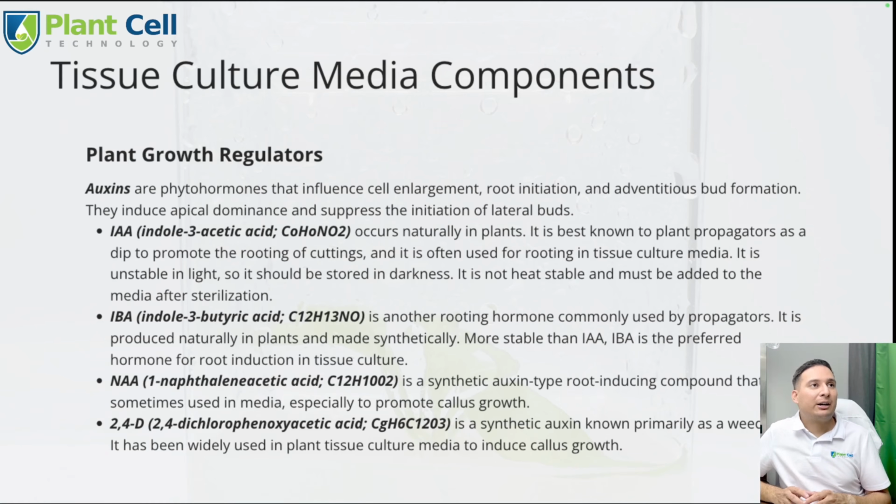But for right now, the general rule is that IBA works great for houseplants. NAA works great for both houseplants and carnivorous plants, but you will see some callus grow. Now, sometimes you definitely do want to grow callus.